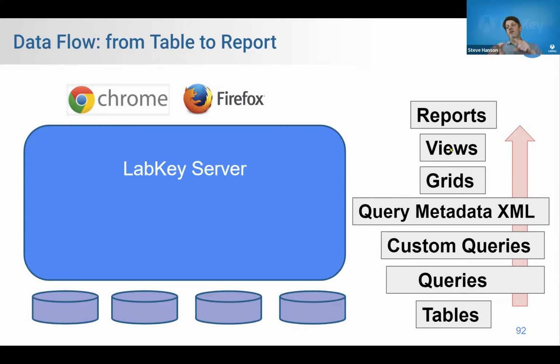And then grids, you can create different versions of grids and save them, and they're called views. And then finally, the final thing that you can create are reports. And I don't mean just visualization reports. I mean, a grid itself can be a report.